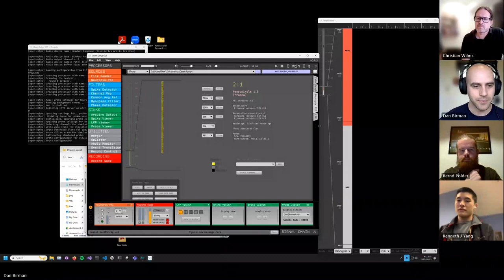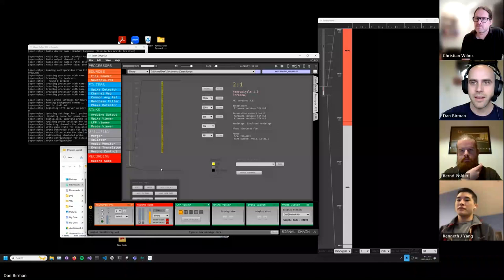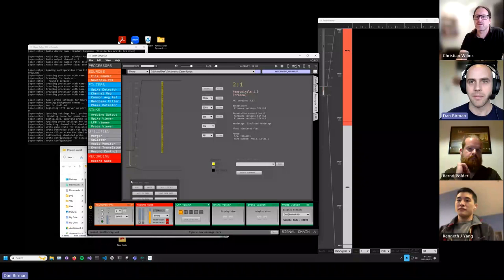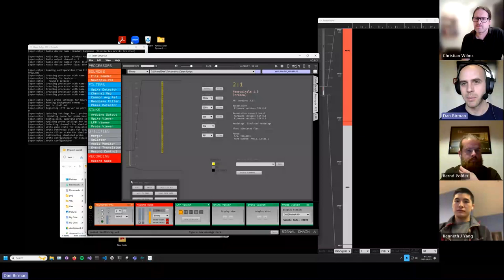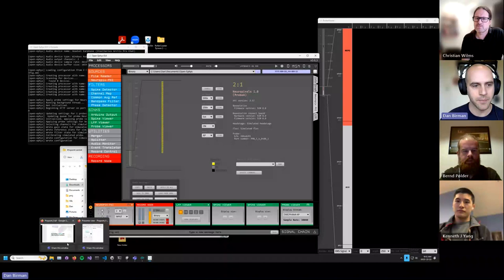This does work for SpikeGLX as well. The setup instructions are a little more complicated than the OpenEphys setup, so I'll let you read the tutorial instructions for that rather than taking time to show it right now.